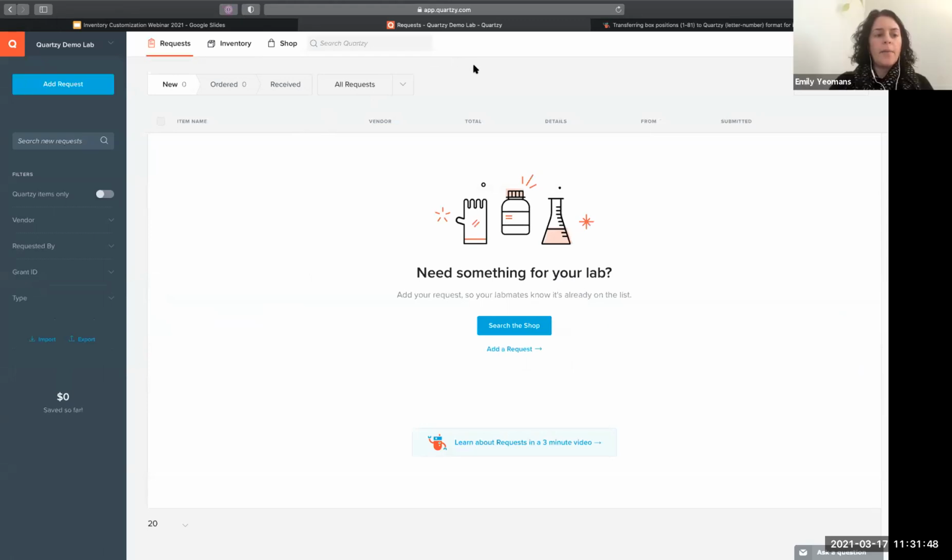Awesome. And then Tom at Happy Labs, hey Tom, asked a really great question about barcode scanning. Curious about the process for adding quantity to inventory and subtracting from inventory. We've been asked, how can I subtract quantities in real time, like with a barcode scanner, as I take them off the shelf and use it? What is the best way to do that, Katie?